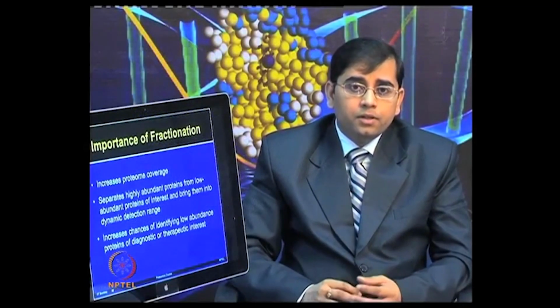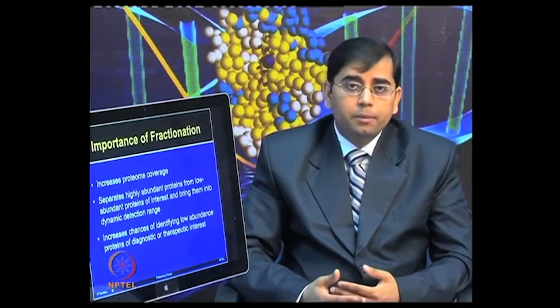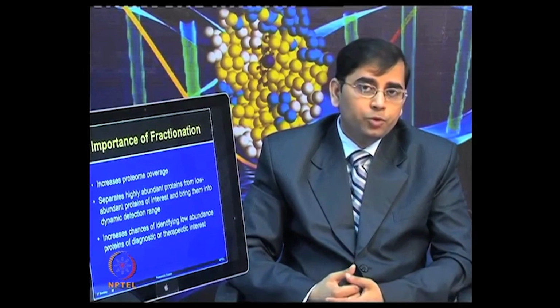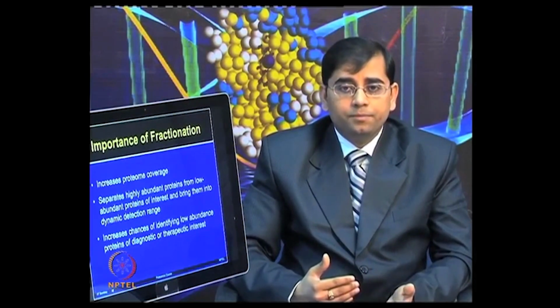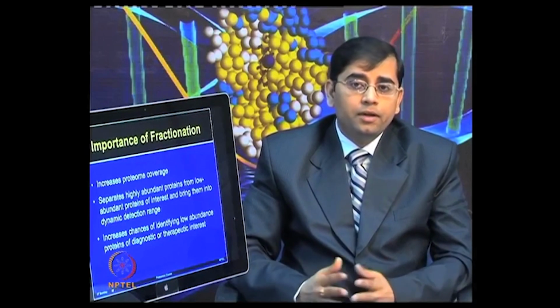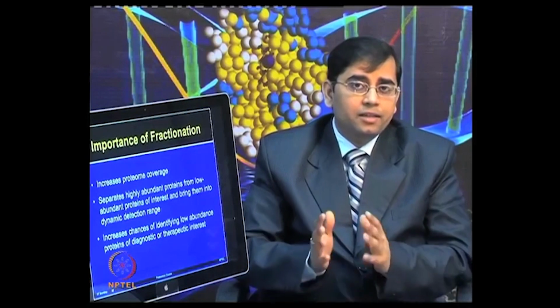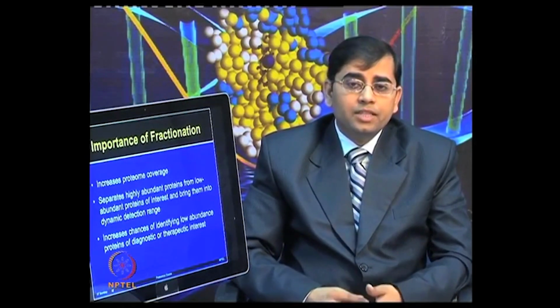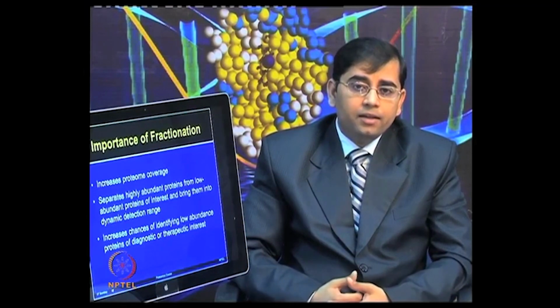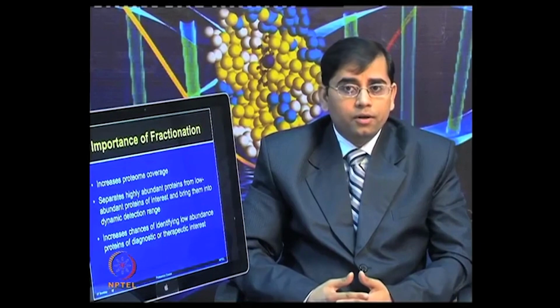Often the low abundant proteins are the proteins of interest, which are being masked by the highly abundant proteins. If you are able to separate the highly abundant proteins, then you can increase the dynamic detection range and bring everything into the same range. Fractionation can also increase the chances of identifying low abundance proteins of diagnostic or therapeutic interest.